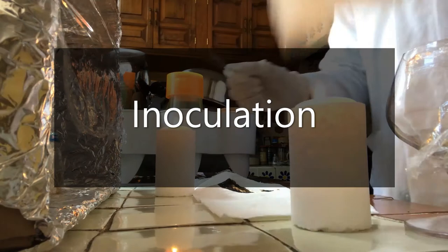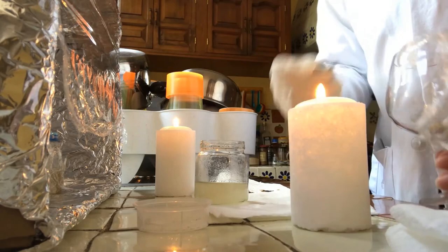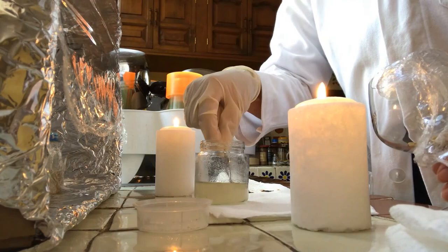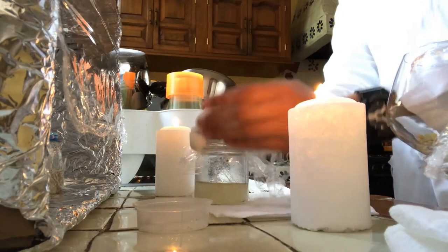For the inoculation process, carefully and using the tweezers, I opened a flask and put 4 lentils on the top of the culture, verifying they didn't get submerged and avoiding touching the jar walls. Then I put a sterilized plastic sheet as a protection cap and passed the jar lid very gently through the flame before closing it. I did the same for the other 3 flasks. For this project, I made 2 flasks with MS media and 2 with my homemade media.